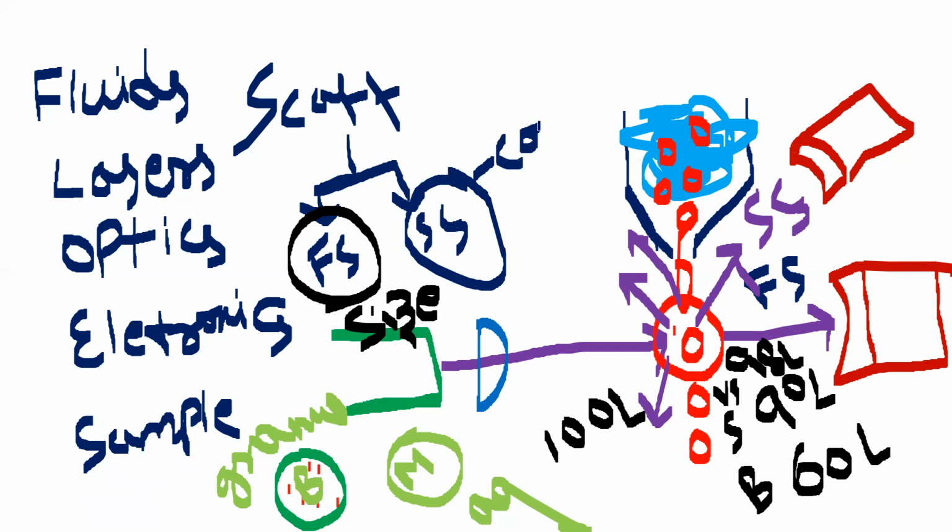So whether it is a granulocyte or an agranulocyte can be detected by measuring the side scattered light. So simultaneously, a flow cytometer is measuring the count of the cell and the size of the cell by forward scattered light, and it is also simultaneously measuring the side scattered light to give us a clue of the complexity of the cell. You got it, right?